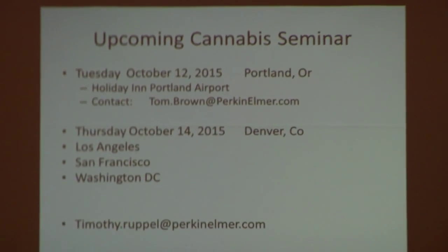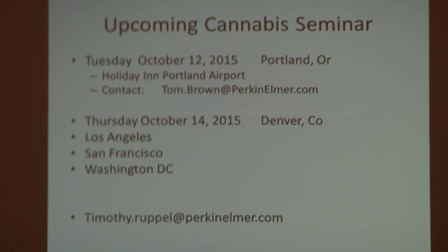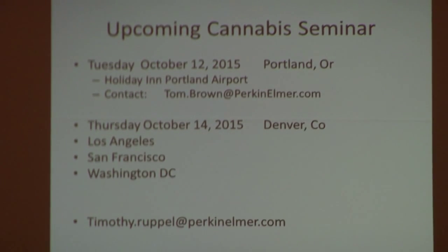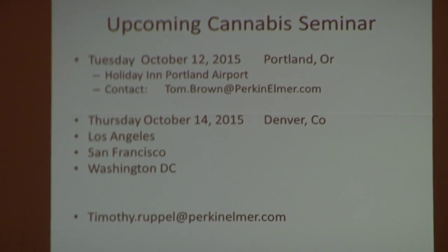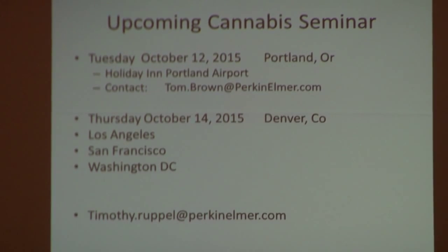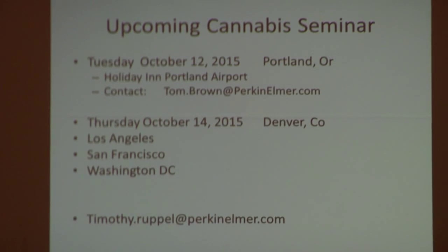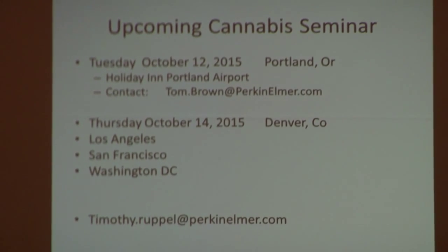If you were to do a residual solvent analysis on the bare plant material, you're talking about part per million levels that you might find in the plant material, whereas anything in the extraction community is going to be in the percent level, much, much higher. So the amount of solvent that the plant material itself is supplying is very minimal and negligible.